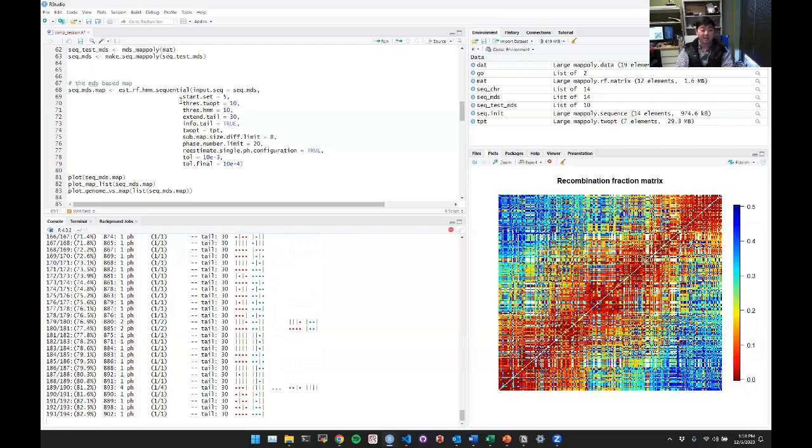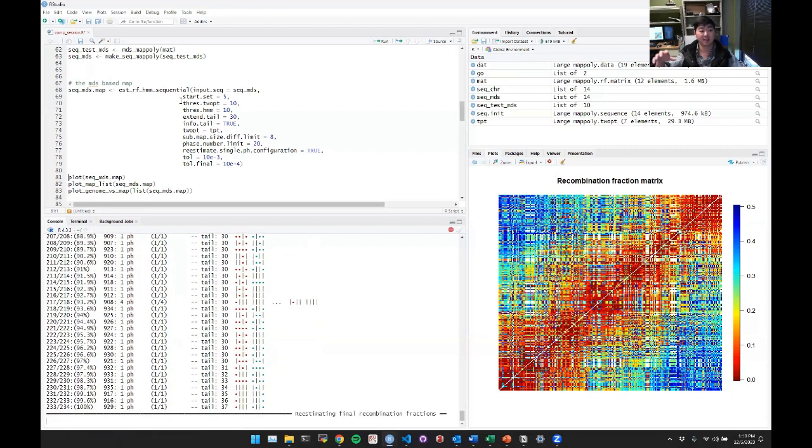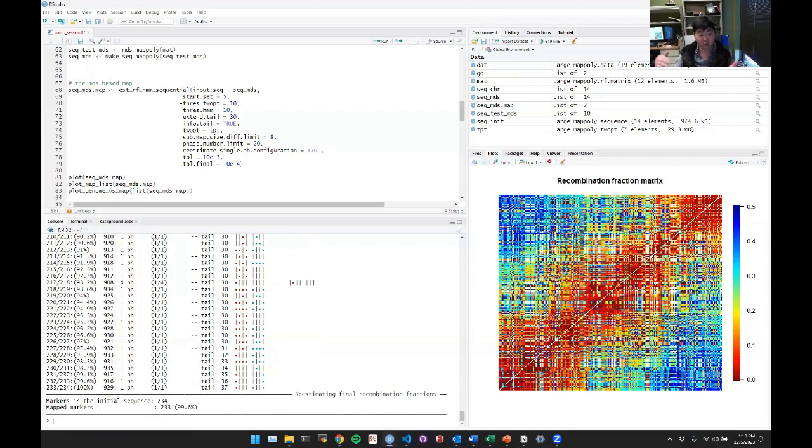Good question. You'll see in this tutorial that in the next steps, we're going to alleviate that. But how we found it is that all of our diploid maps and all of our tetraploid maps at first were mapped using an MDS method. Even though MDS has very small local inversions, it can let you see large genome-scale inversions. So we mapped it using MDS, then we compared the linkage maps with the genomic order, and we found that at the same place on every single map there was this. Let me see if I can plot it.